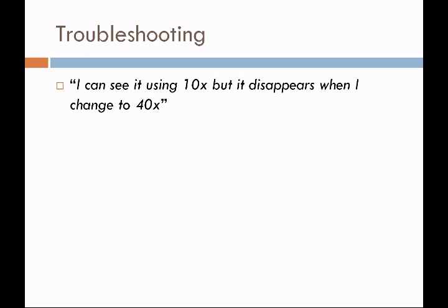Troubleshooting becomes an important part of microbiology because there's only one of me and usually 20 or more of you in the lab. One common issue is: I can see it using 10x, but it disappears when I switch to the 40x objective. Your slide may be upside down. The working distance is crucial — if the slide is upside down, there is too much distance between the slide and the objectives, so you'll find it at 10x but not with the 40x lens. You can check if a stain preparation is upside down by scraping the stain with your fingernail — it will come off, telling you which side is up.